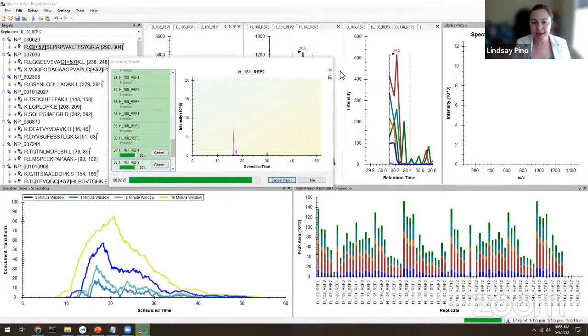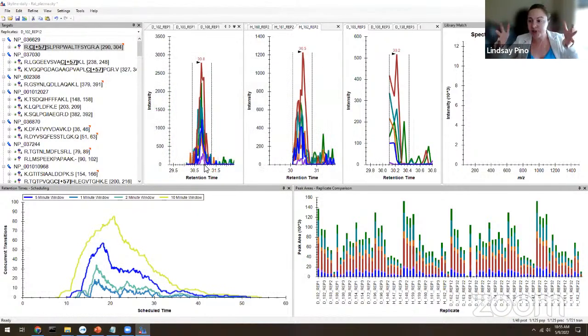As you're selecting peaks, if you don't have an internal standard, you don't have a heavy peptide, and the peak is consistent across 3 injections, is that correct? That would indicate to me that probably it is correct. You could also look for other potential peaks in your full chromatogram. Other peaks might look similar across your chromatogram. We're going to hopefully show you how to do that in just a minute.